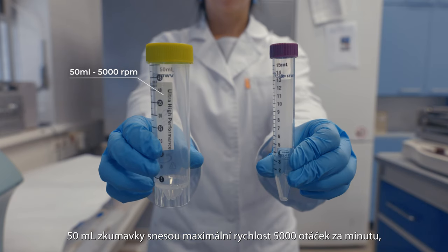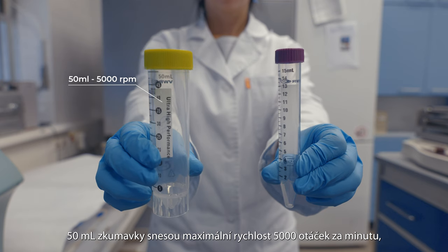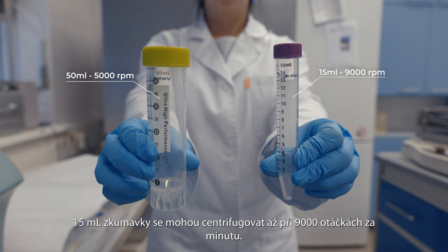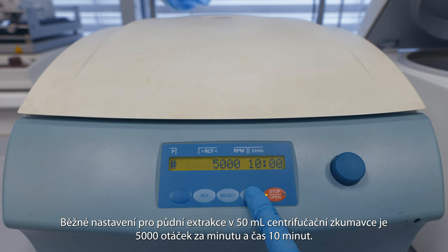50 milliliter tubes can handle a maximum speed of 5000 rotations per minute. 15 milliliter tubes can be centrifuged at up to 9000 rotations per minute. The typical setting for soil extraction in a 50 milliliter centrifuge tube is 5000 rotations per minute and a duration of 10 minutes.